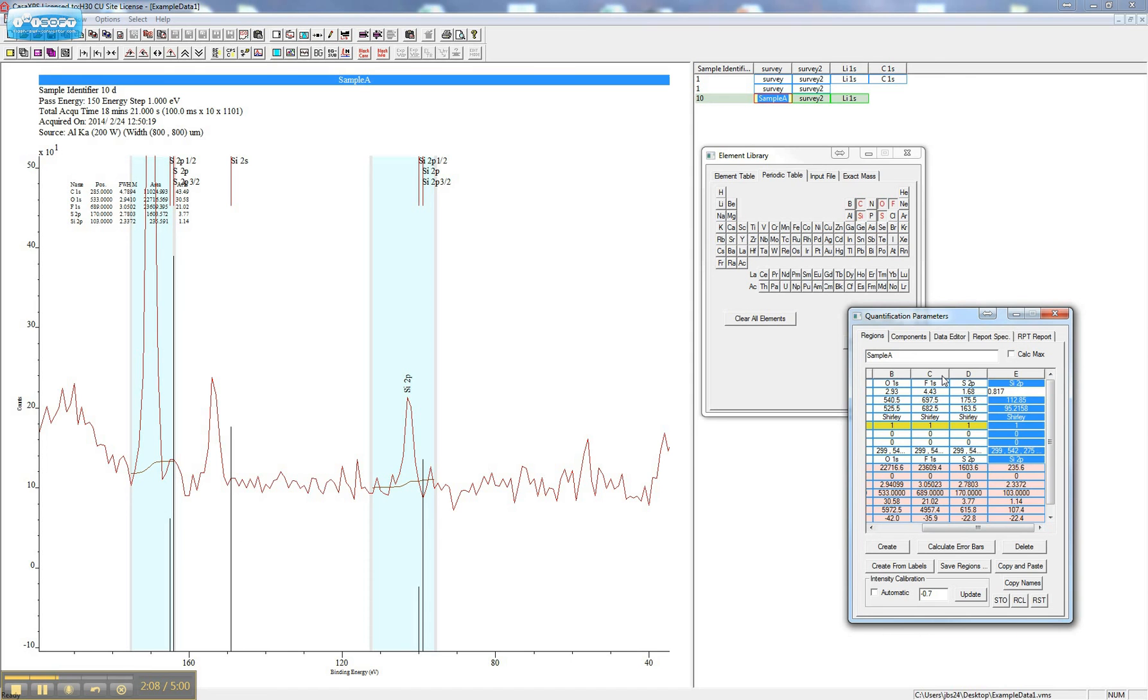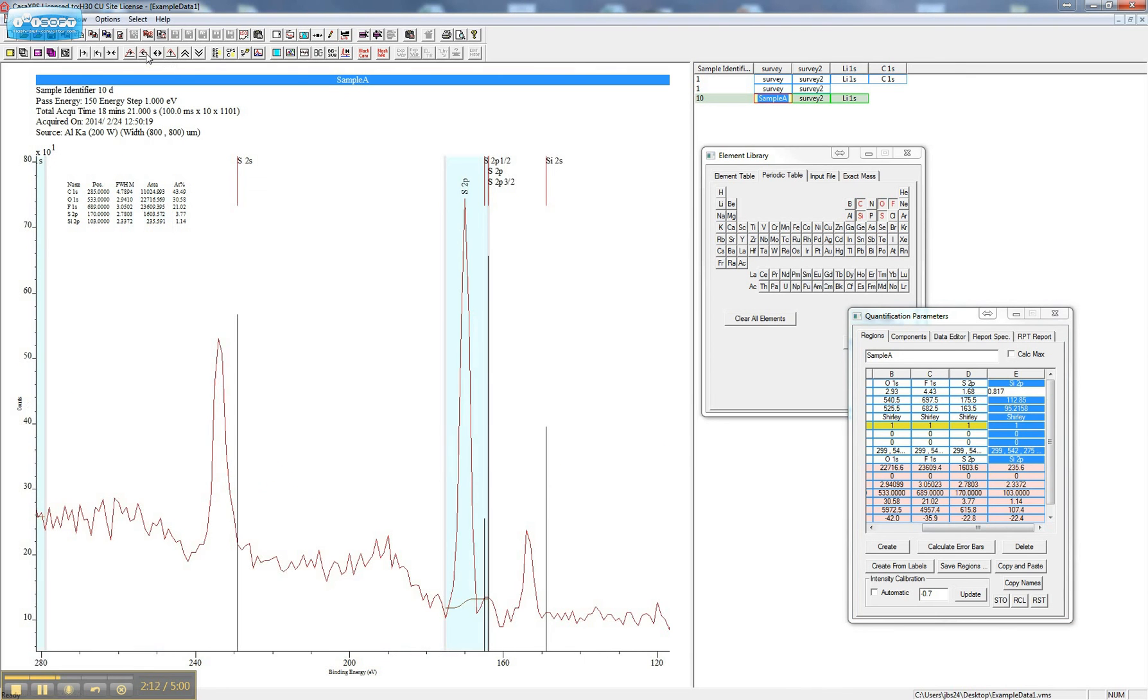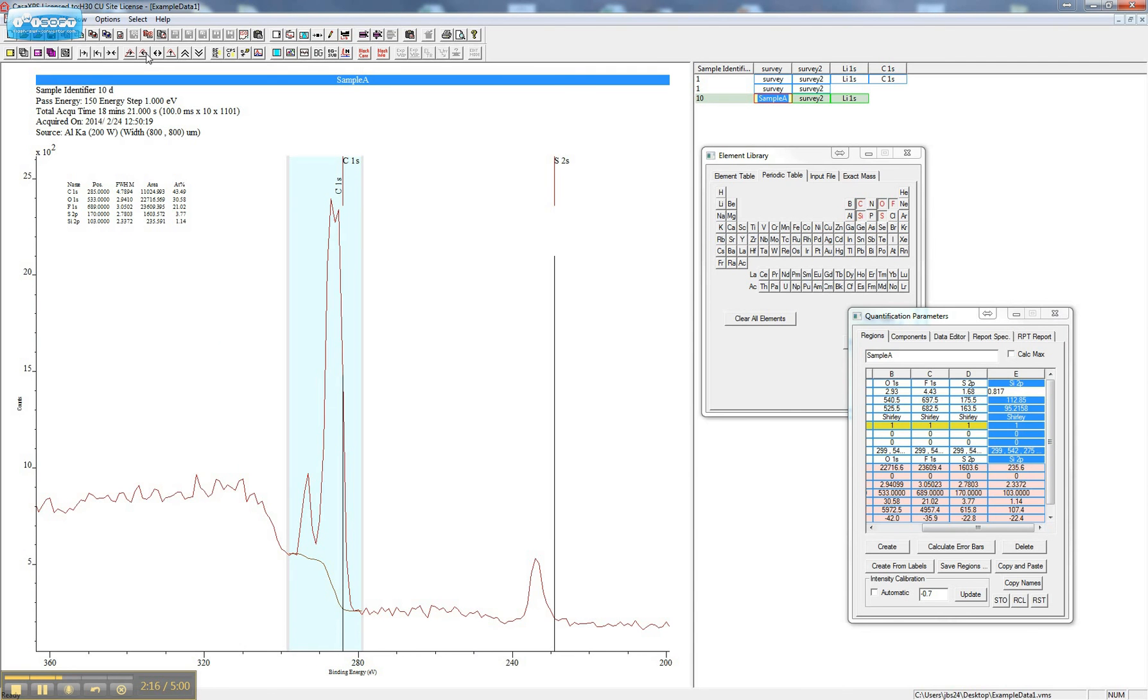You may need to check and adjust the regions for all your other peaks and check that RSF values for doublets are not being used for singlets, and vice versa.